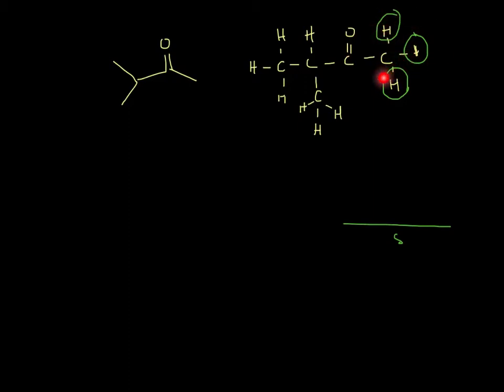And instead of circling them individually, you could circle all three of these the same. So let's just say that these are together in environment A. They, of course, don't know any better. They're just a peak. It's a CH3 that's next to a carbonyl, so that probably appears somewhere around 2 to 2.5. I'm going to say 2.1 ppm.